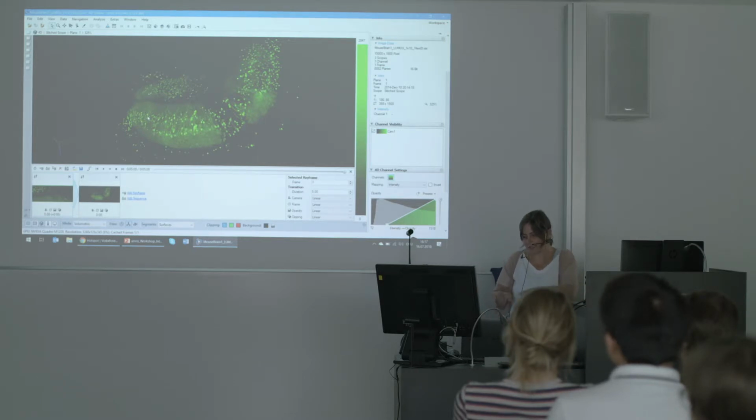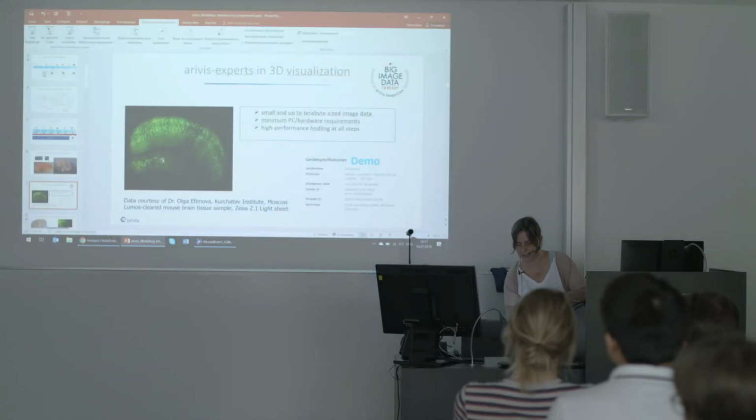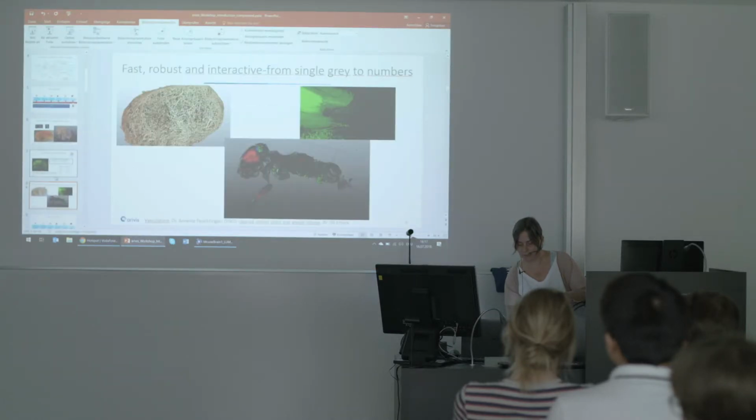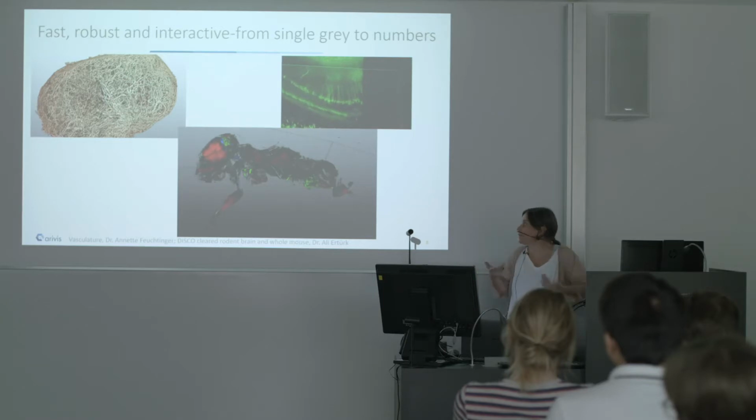So that was just a short excursion into the software. David is going to give you a much better insight in a second. If I'm always claiming that we are experts in large image data, I think I have to prove it at some point. So that was the point. I've proven it for once. And now I would like to continue to give you a little bit more of a summary.